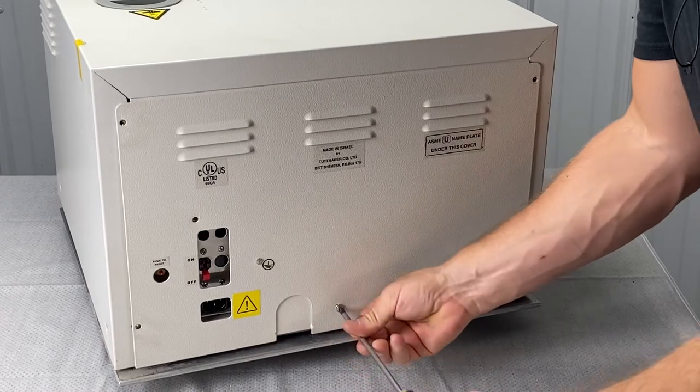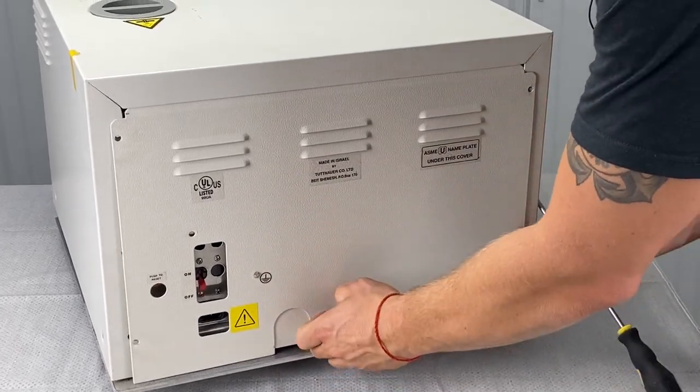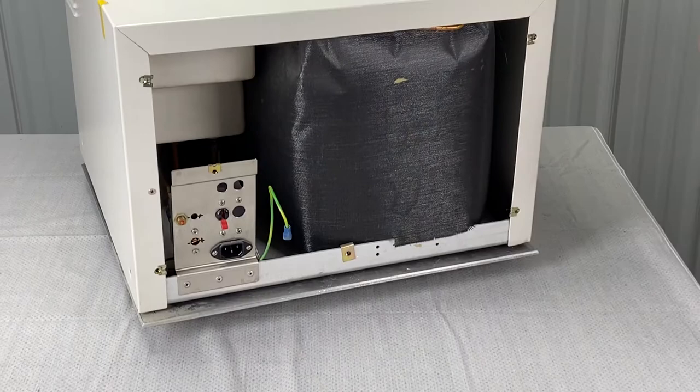Last but not least is the bottom middle. Once you unscrew the last one, it's going to fall out. We have a ground here — we have to unhook the ground and discard it to the side.